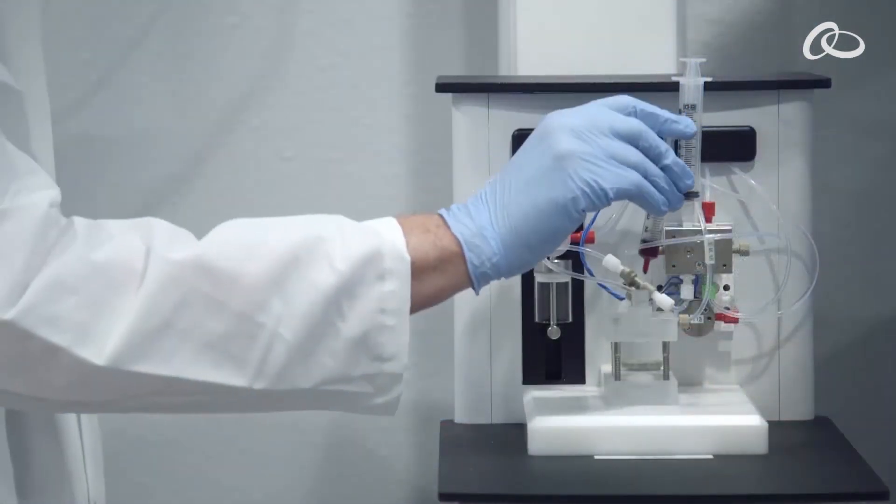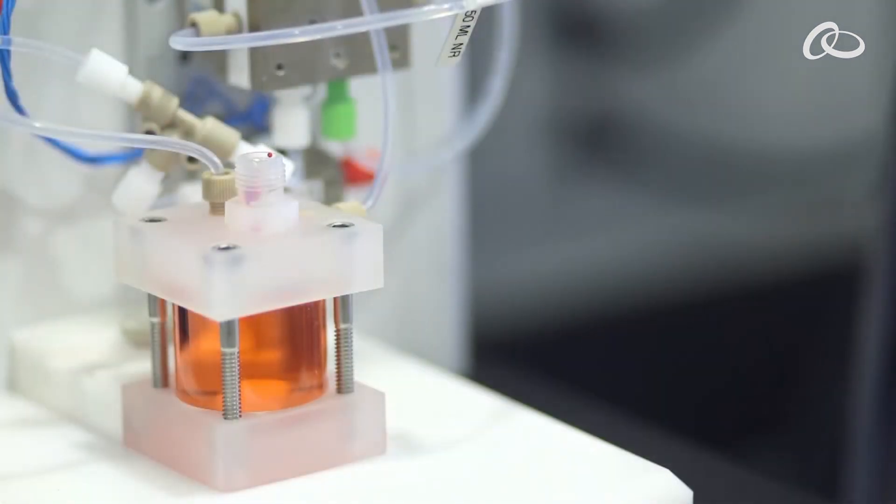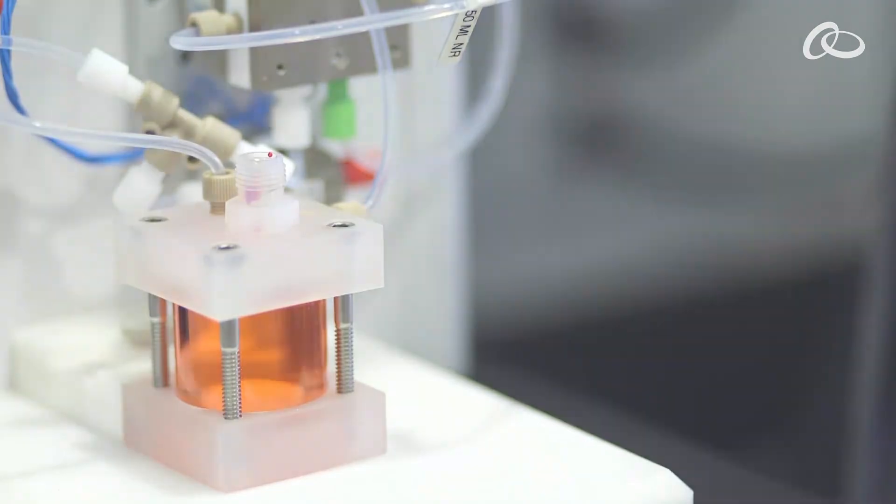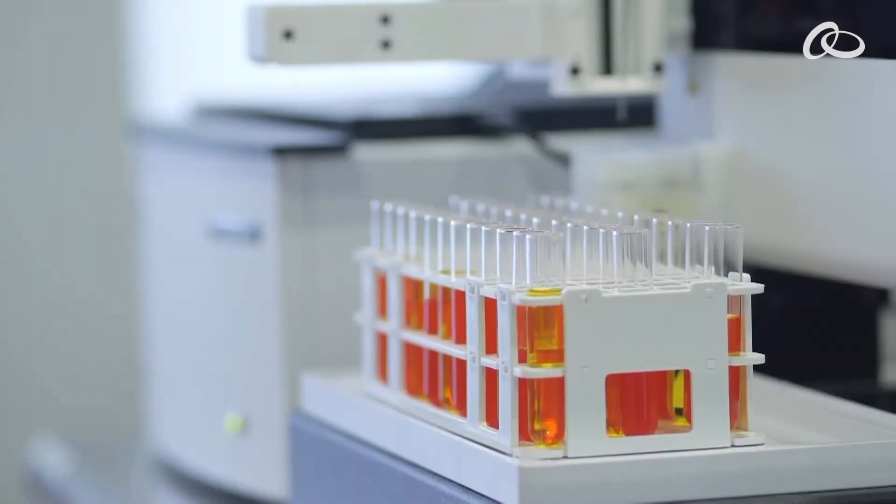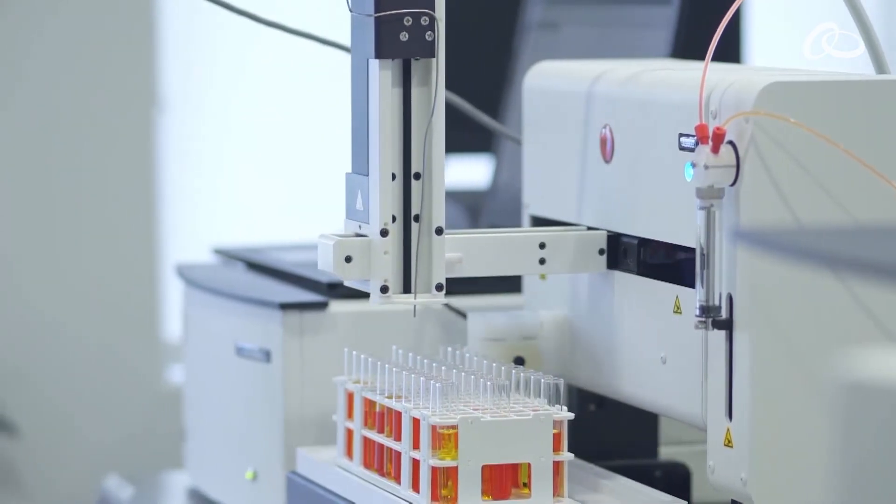The AccuSizer APS uses two-stage dilution for highly concentrated samples, such as high concentration emulsions. All of the AccuSizer systems can be integrated with the auto-sampler for high-throughput particle size analysis.